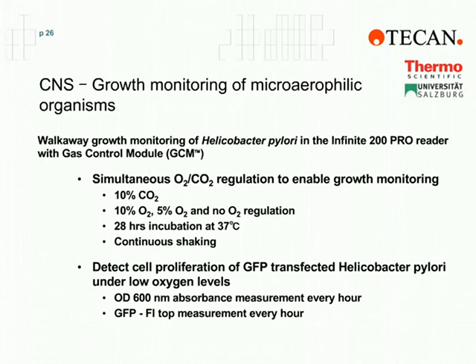The last assay we want to focus on is growth monitoring of Helicobacter pylori. This is actually a very good feature in terms of looking at a multiplexed assay. So not only did we want to show that a GFP-transfected Helicobacter pylori actually is increased by low oxygen levels, but this really coincided with an increase in the OD600 absorbance value, really showing that the growth curve is really associated with an increase in the GFP signal.